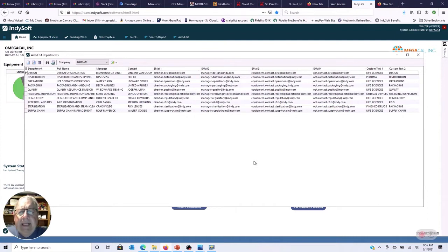Let's discuss the department table at a high level. We found it useful in managing over 150 departments with over 24,000 instruments by identifying 4 contacts for each department in our company. With 150, if you multiply that by 4, that's a lot of names you're managing. But it's worth the effort to administratively manage this to then allow the alarm module to do its magic.